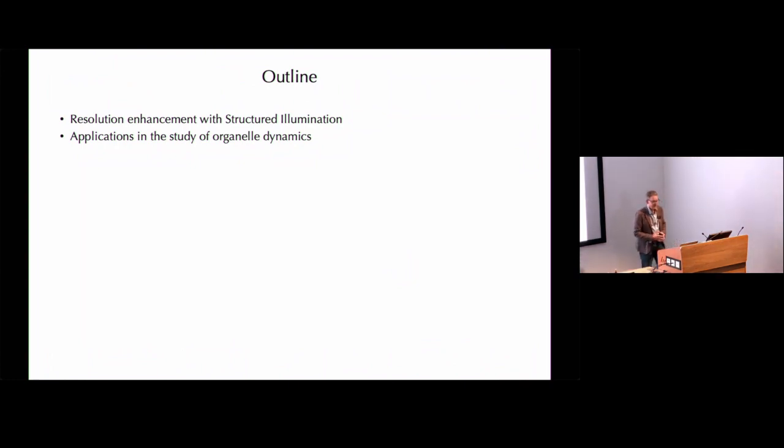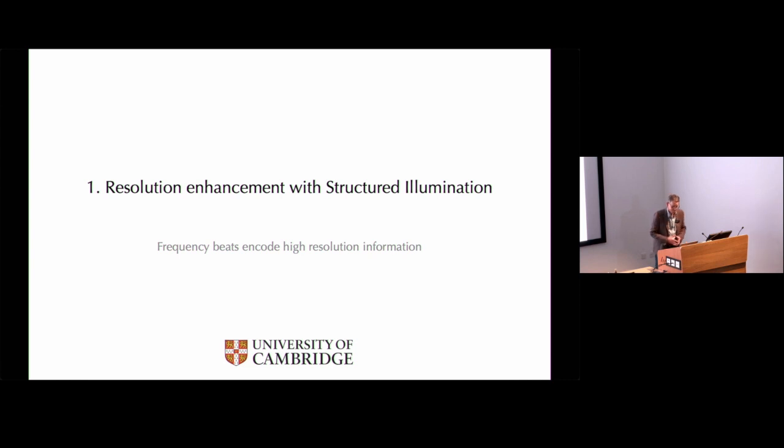So very briefly, for those who don't know, I'll just show you how structured illumination works and what we're doing, what the problems are, and then I'll give you some examples of it. The idea of it is very simple and very elegant. The idea is to generate frequency beats by putting illumination structures onto your sample.